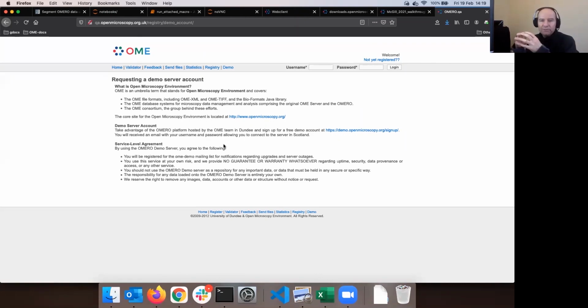Why did the Ome team host that server? Well, because again the Ome team wants to propagate and showcase the software called Omero, but this time not in a single workshop situation, but as a continuous service for the whole world, so to say.